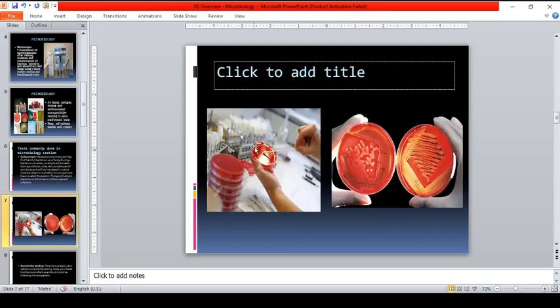So this one, that is, you either submit a sample and then inoculate the sample into a culture media. Actually, guys, this culture media is referred to as the sheep's blood agar. Bakit siya sheep's blood agar? Because the culture media contains sheep blood, okay? Literal na merong dugo ng sheep sa agar na to.